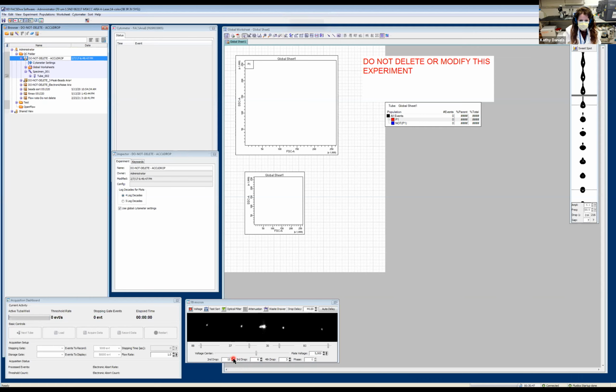So as I start adjusting this second droplet percentage correction, you see that it gets nice and tight there. As I start going too far up, what do we see? We see the same thing happening if I go too far up in the second drop.